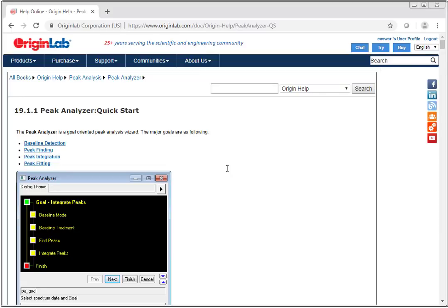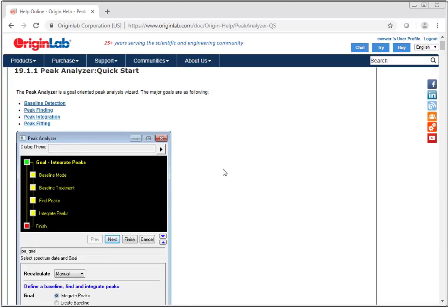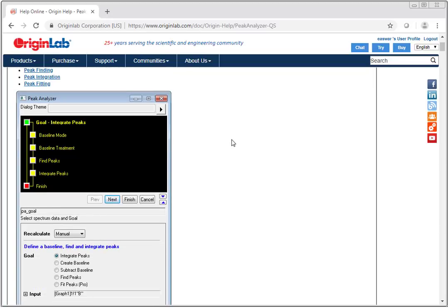Origin provides a peak analyzer which is a wizard-based tool that provides multiple goals like peak finding and peak fitting. This is an advanced tool with a variety of options, however what if your requirements for peak analysis are simpler?